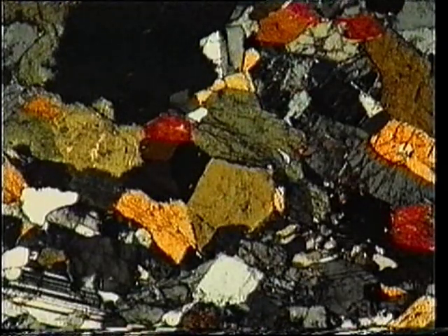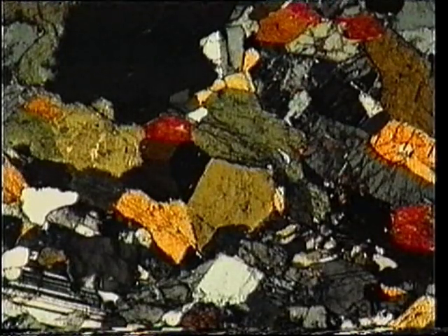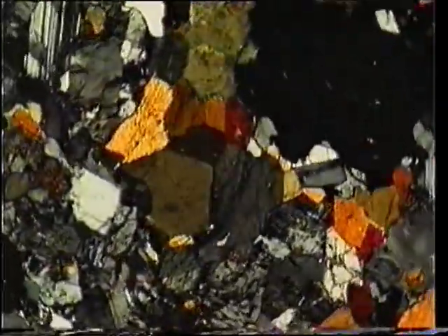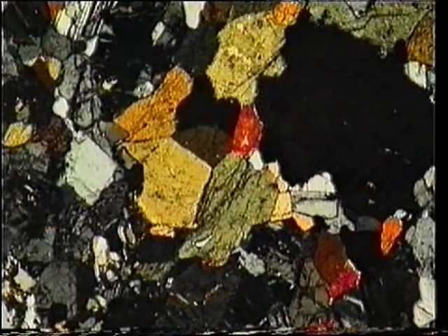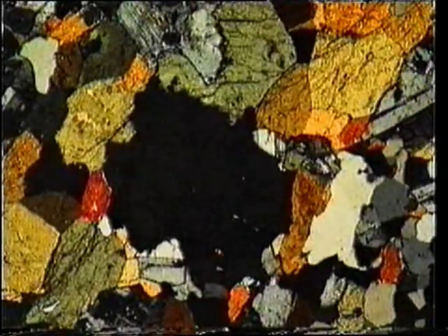There's a possible lowest interference colour grain near the edge of this field. Shift the grain to the middle of the field. It remains almost at extinction.